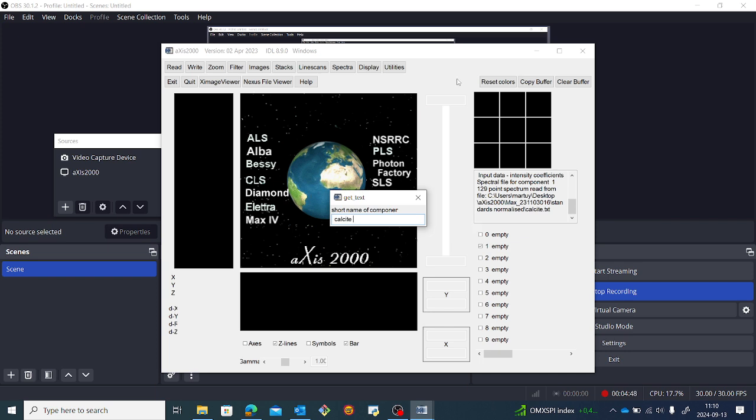The reason why is that the output, which is the component map corresponding to the calcite reference compound that I'm reading, will have a name which is a combination of the reference compound you provide and also the root name. The root name is the input file that I read right at the beginning, which is my image stack. So I have deleted unnecessary information to avoid having a very long component map name.